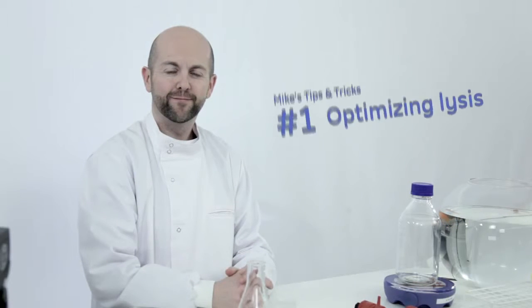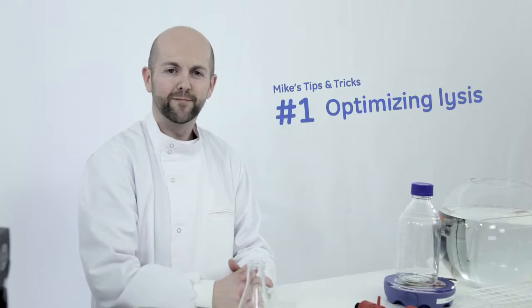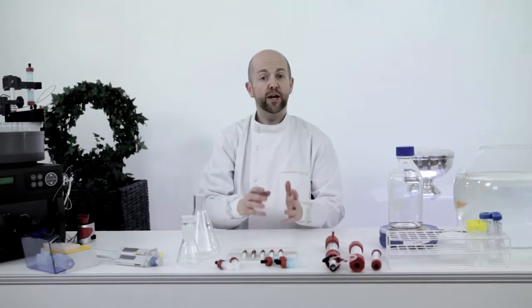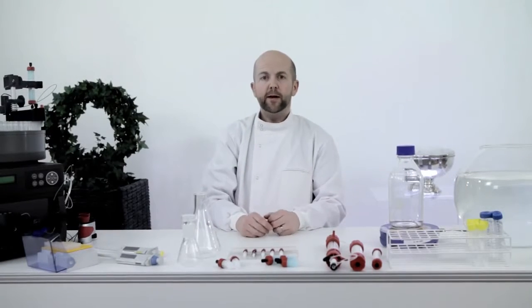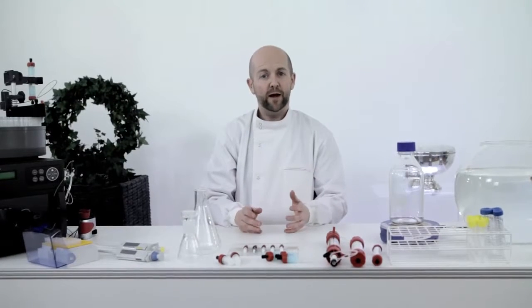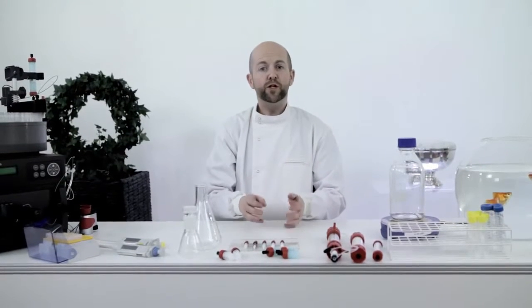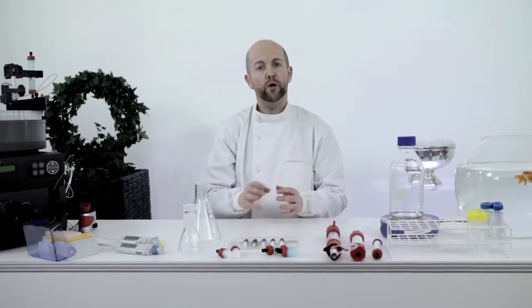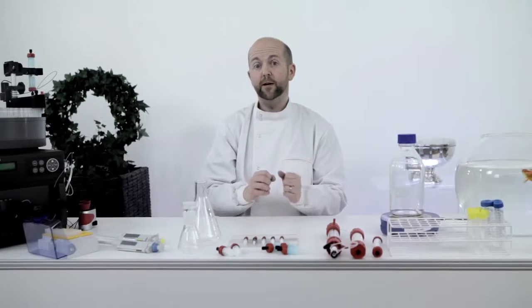Okay. Mike's first tip, how to optimize cell lysis. It really is simple. I make sure that the sonication is done carefully and well. I then add lysozyme and DNase to the sample, reducing the viscosity and making it easy to load large volumes onto the column without increasing the back pressure.